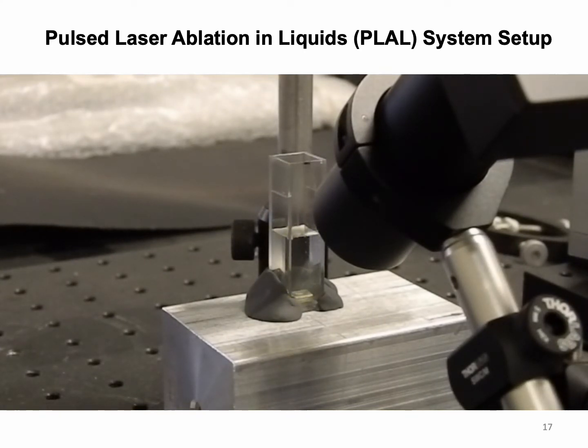As the laser pulse ablates the metal target, nanoparticles are condensed in the liquid and stabilized by the stabilizing agent added beforehand. The procedure ends when the solution turns yellow, an indication that the nanoparticle colloid is formed, and also when the laser starts to get absorbed by the formed nanoparticles.